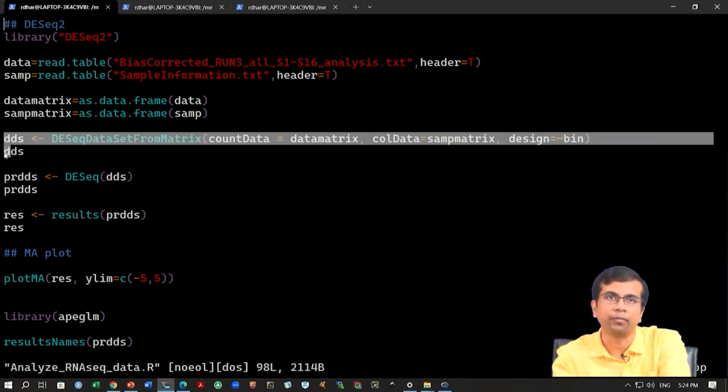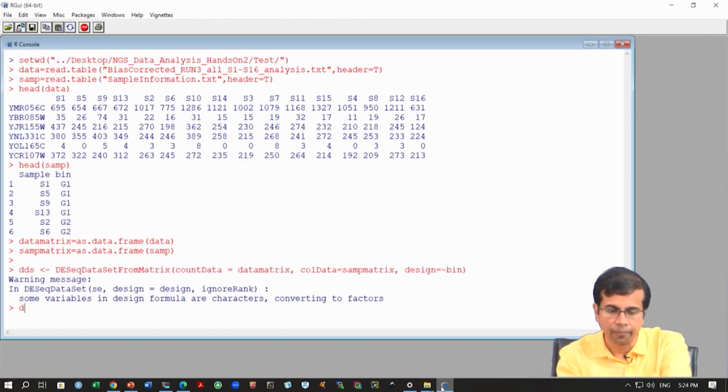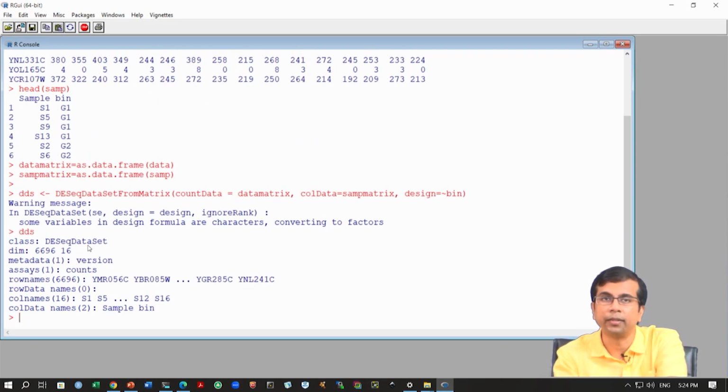This is a command that we used before when doing the preliminary analysis, and we will use the same here. Okay. So, we will copy this command and I will simply run this here again. Okay. And it gives some warning message, but that is okay. We have seen this warning message, as long as it is not giving any error, it is all right.